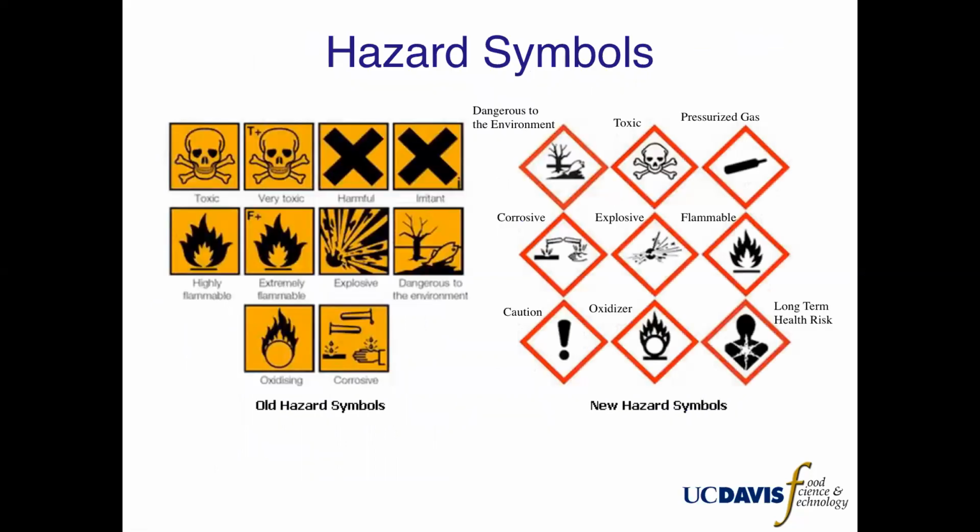These hazard codes are also associated with hazard symbols. You will see these symbols on the chemical bottles. Each symbol depicts the hazard associated with the chemical.